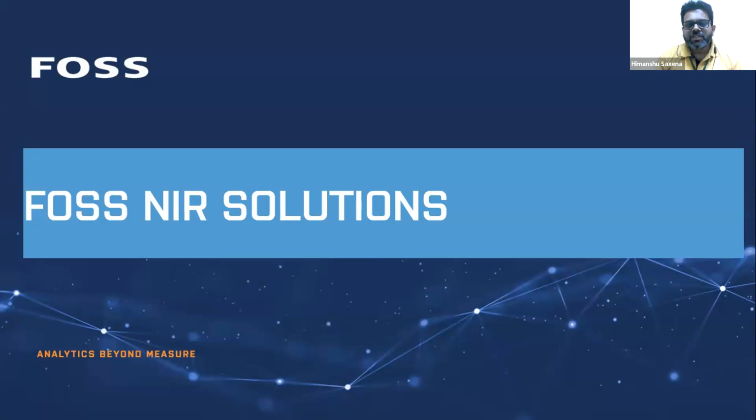So our focus is not just to develop different applications for the sake of proving that NIR can do some kind of correlation there, but more to say that yes, this is something where NIR can be commercially adapted. So I will be briefly talking about what solutions we have, what the application areas of these different models are, and why we have chosen a particular kind of spectrometer or a particular technology within the NIR domain.